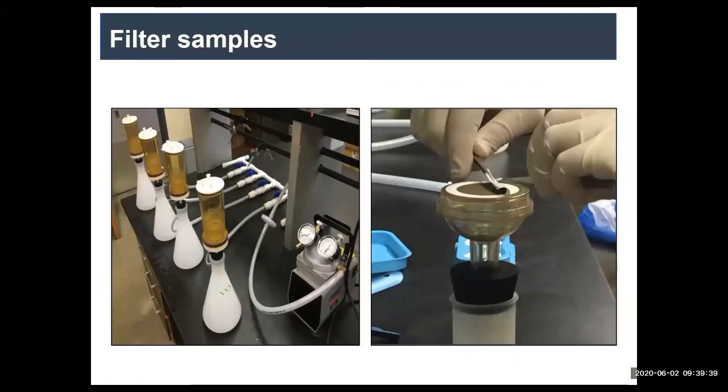Our filter rigs look something like the picture on the left. Once the water was drained, we would roll up our filters in what we called a taco. This may look like a very simple picture, but don't let it fool you. It's like watching paint dry. There were some nights where we were sampling until 1 a.m. and then well into 5 a.m.